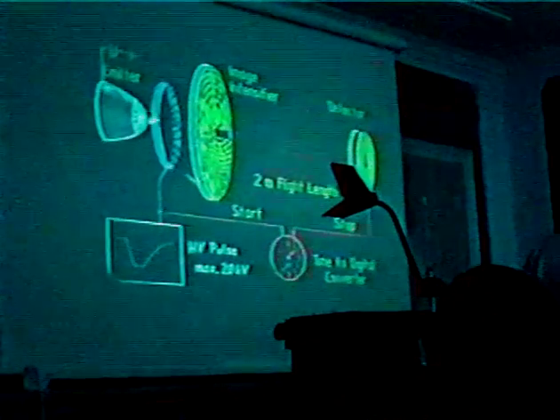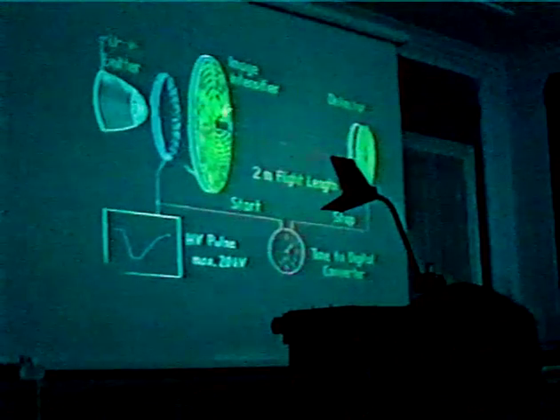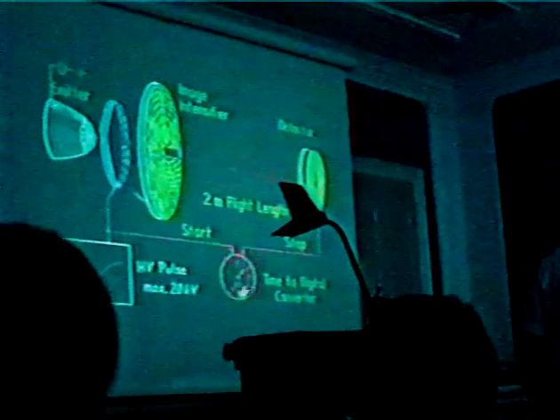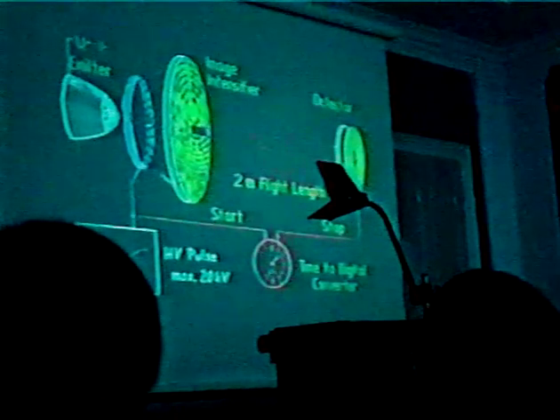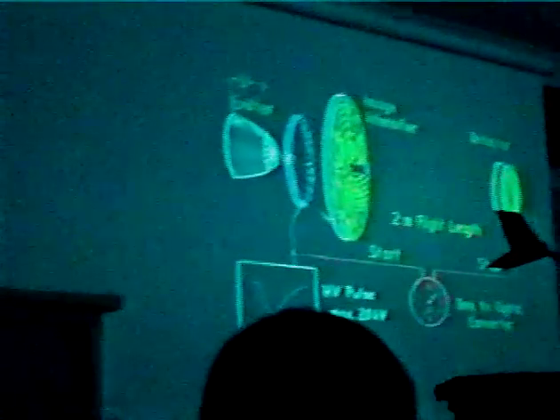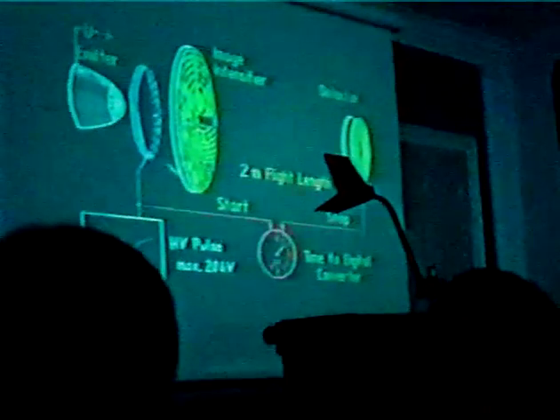Now, we can image the surface at an atomic scale with atomic resolution, and we have a little probe hole here. Particles which pass through this probe hole are analyzed by time of flight measurement, so we can identify chemically what particles are desorbed from the surface. We can tilt the surface so we can have any of our low index planes facing the probe hole for mass spectrometric analysis.